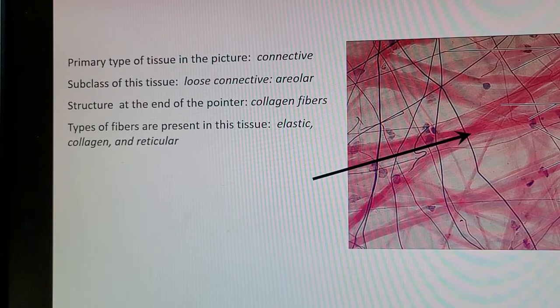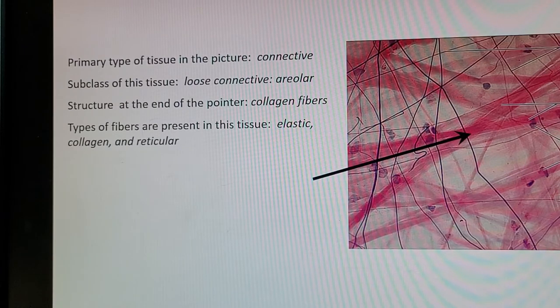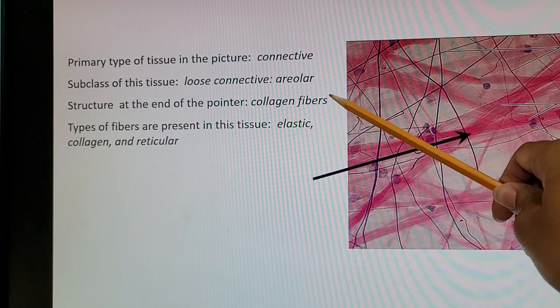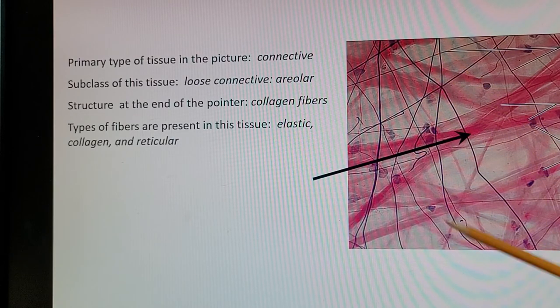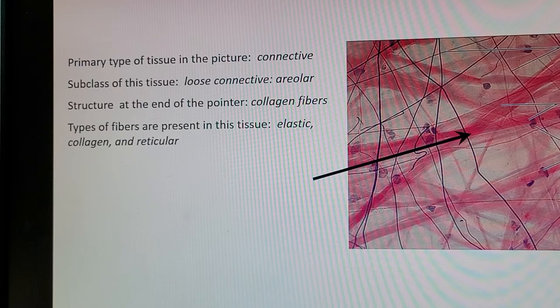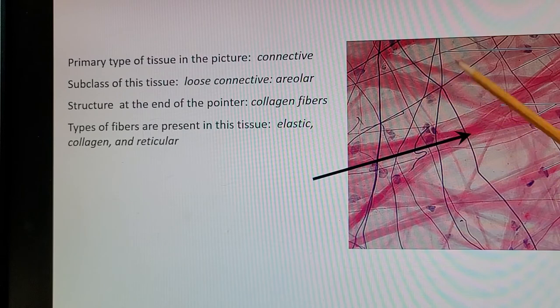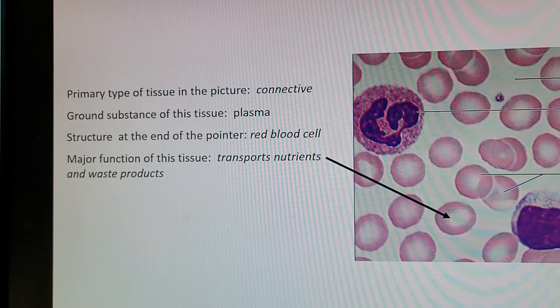Next one is a connective tissue type. Connective tissue usually has a lot of space between the cells. The subclass is loose connective areolar tissue, with fibers including elastic, collagen, and reticular. The big thick pink ones are the collagen fibers — that's the answer for that question. You also have some elastic fibers. Reticular fibers aren't visible here but are present. The fibroblasts are the little purple dots, and there's a lot of space running between the cells.